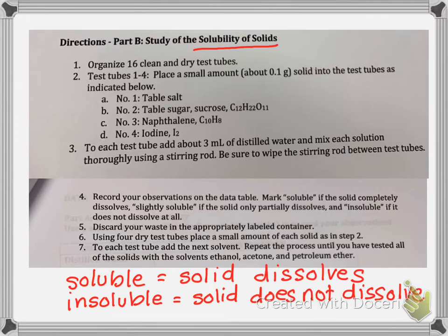In this experiment, if you were doing it in lab, I'd tell you be very careful not to saturate your solution. A saturated solution means that it has all of the solute, the substance that it's dissolving, that it can hold. And when a solution becomes saturated, it no longer can hold or dissolve any more solute, and so the solute just sinks to the bottom. This is deceptive when we're trying to figure out if something will dissolve or not, because we think it won't dissolve, but in truth, it's just not dissolving because we've added too much.